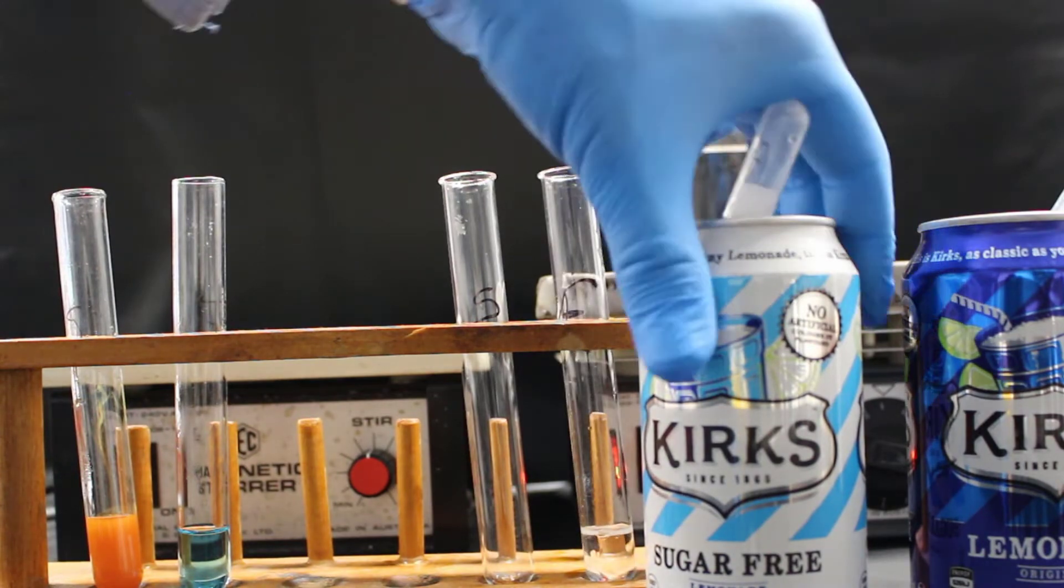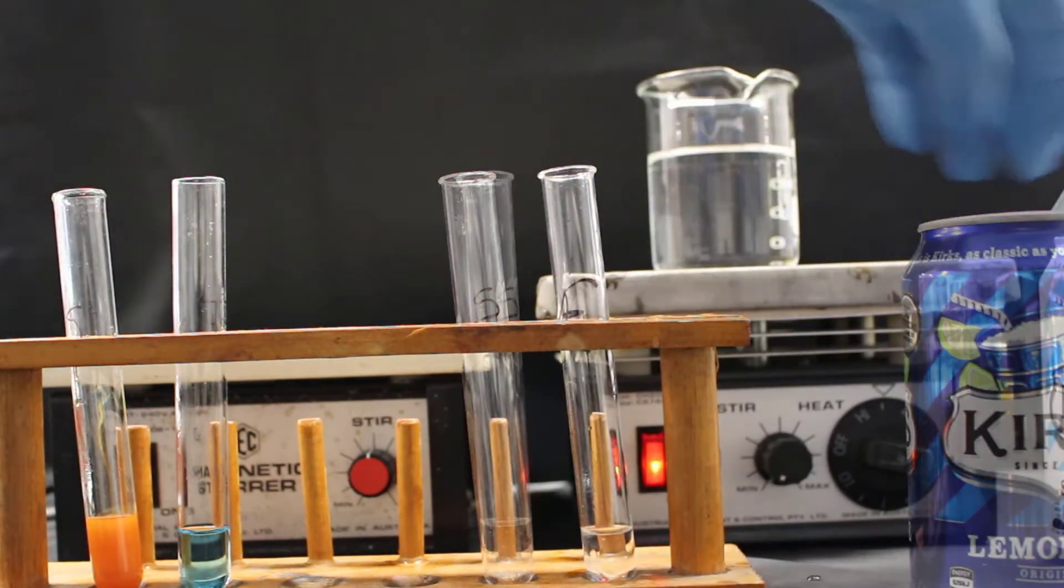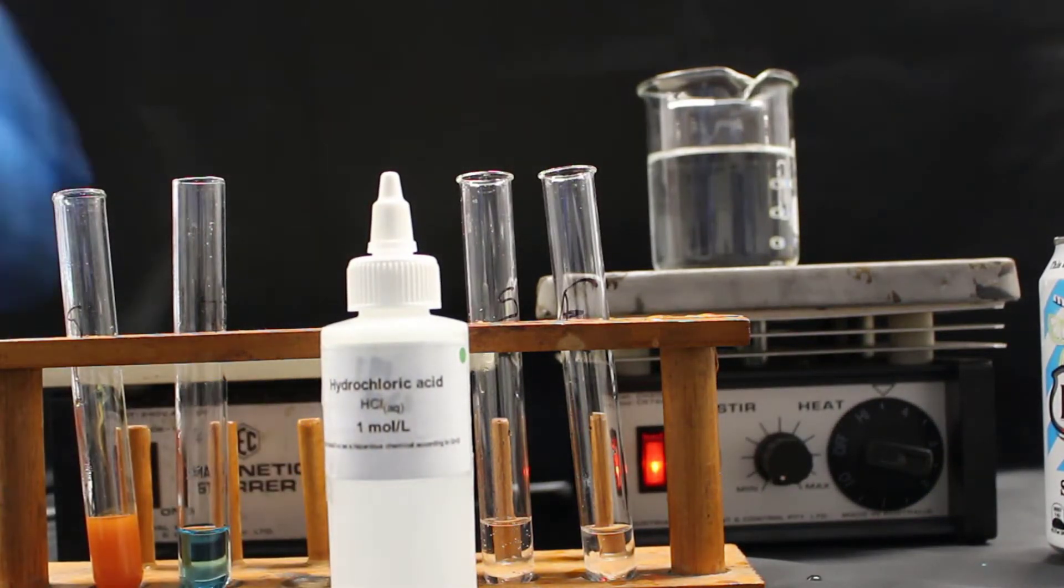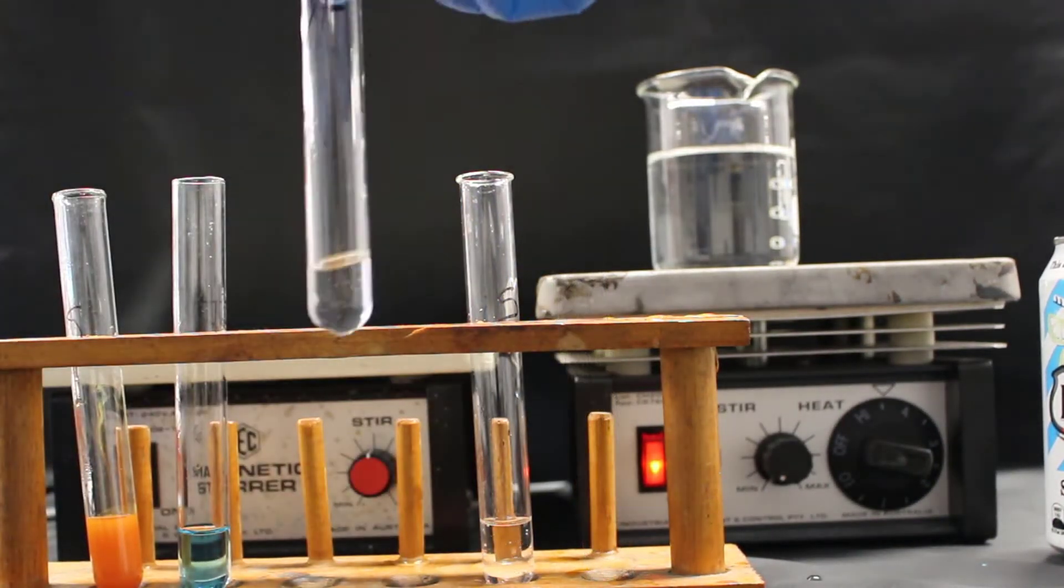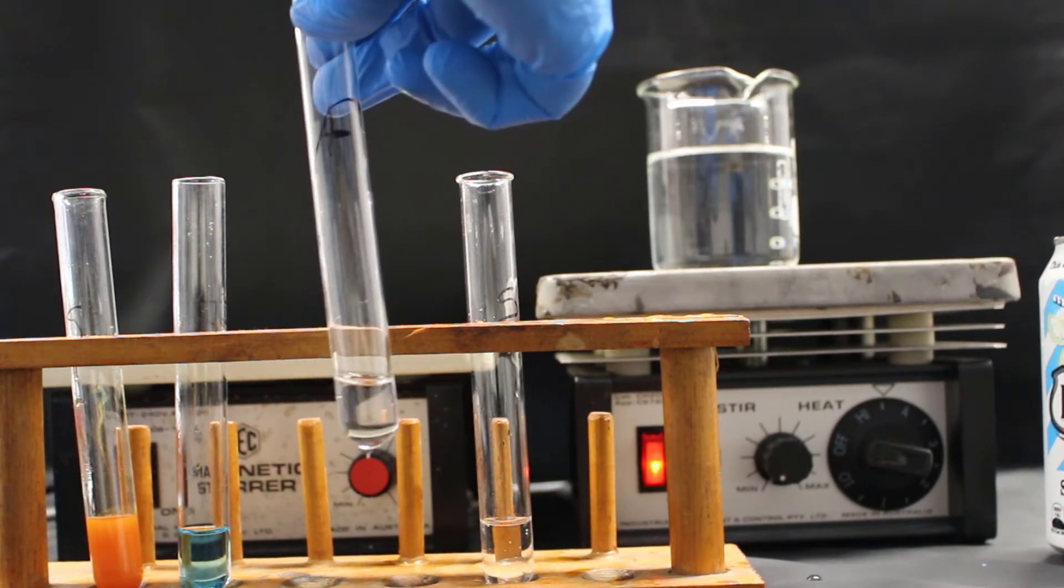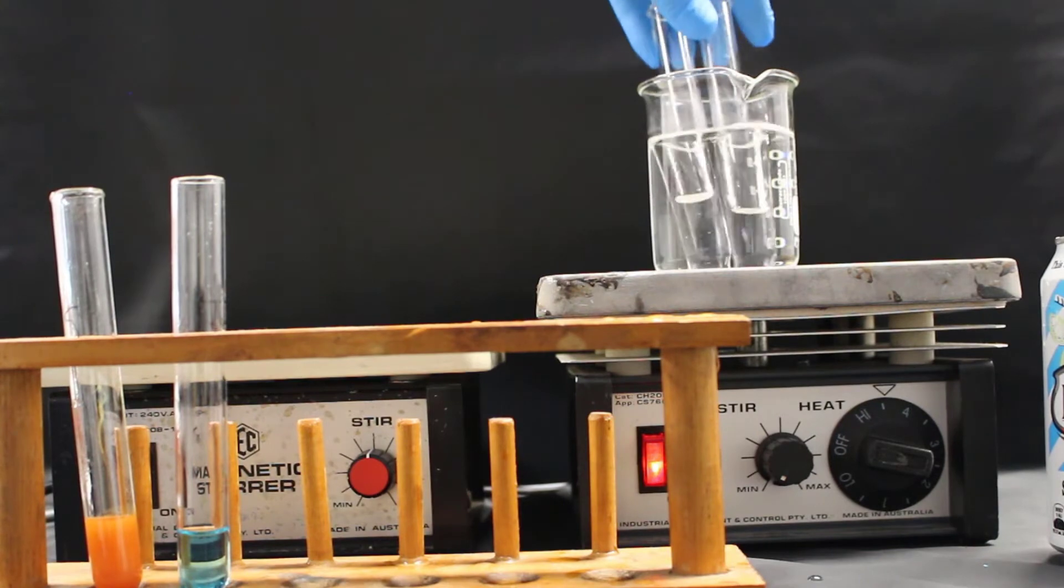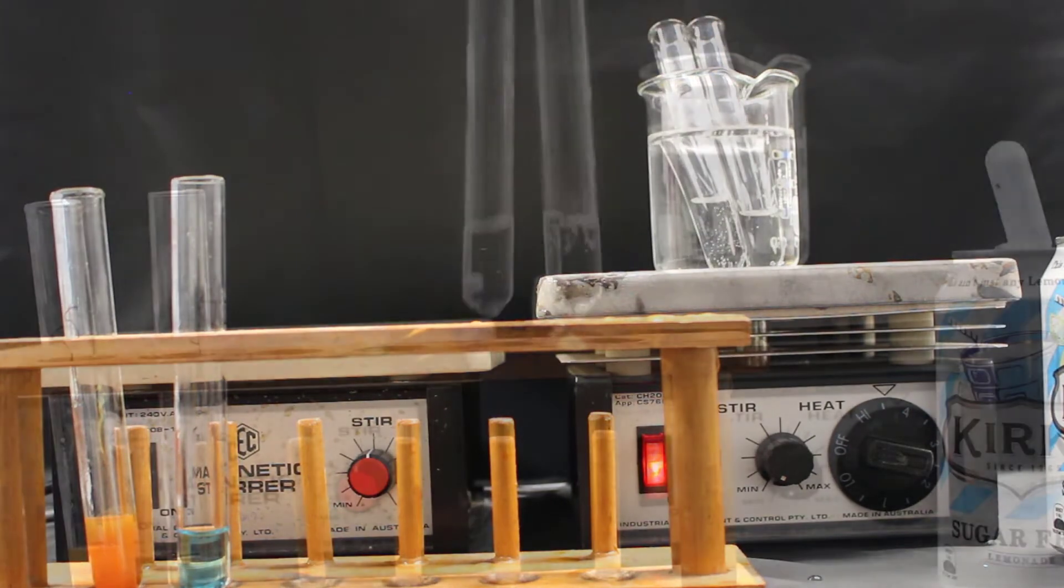The first thing we do is put 5ml of lemonade in each of the test tubes again. But this time, we also add hydrochloric acid. 5ml of hydrochloric acid are added to each of the test tubes. And then the test tubes are boiled in the water bath for 5 minutes.